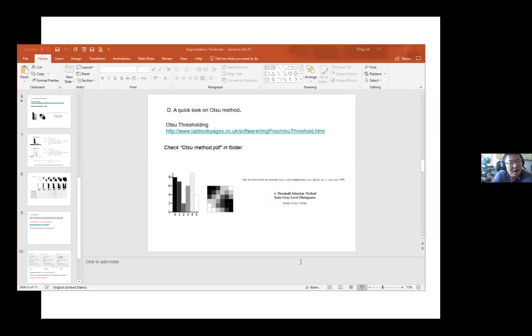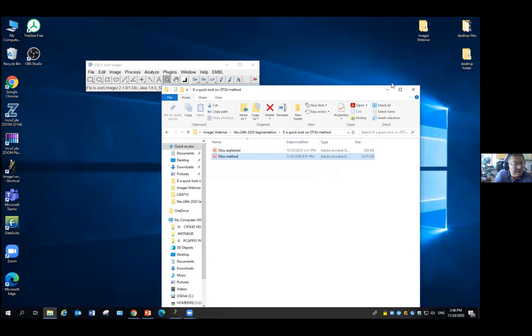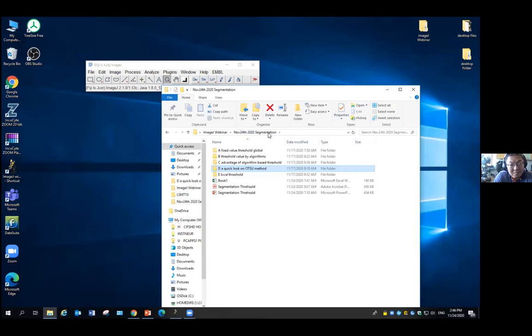So consistency is much more important than a good result in a single image, in a single data point. You always need to make sure you have multiple images in each condition. You have to measure them and treat them the same way. Then you can compare the different groups and see if they have statistical significance.